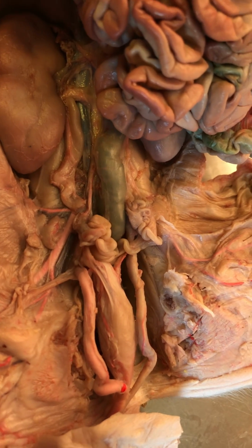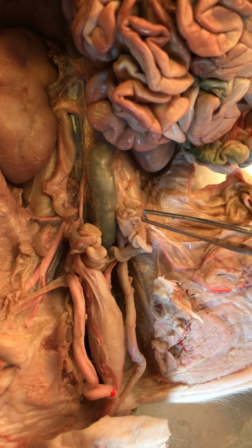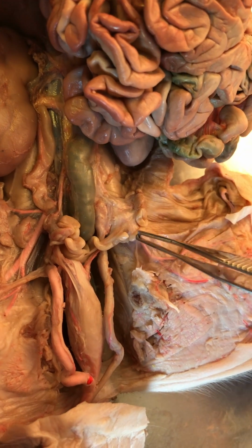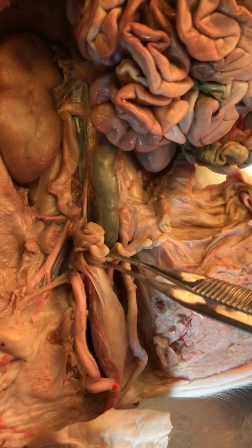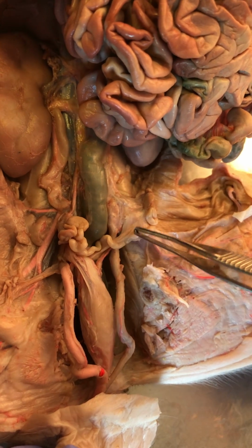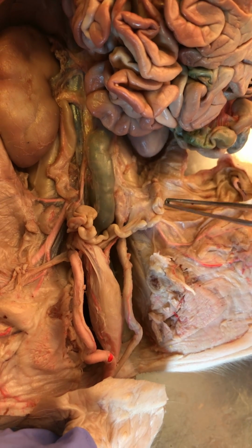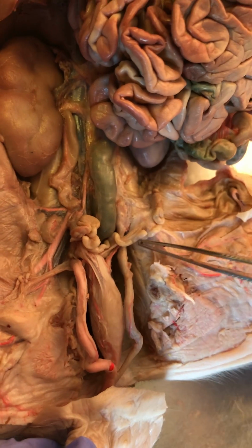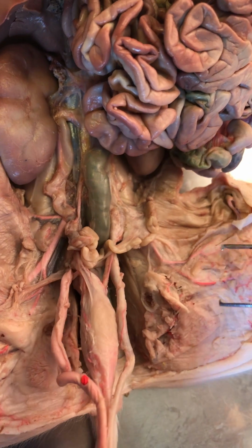There are tiny tubes there, right? You see that? That's actually the oviduct. That's the oviduct. So that means, well, what is this, right? This is the horn of the uterus. So remember, she's a fetus. The other horn of the uterus is here. And if these guys had grown up, they'd weigh a couple hundred pounds, I guess, and they would have a whole litter of fetal pigs. So animals that have litters typically have horned uteri like this. It's unfamiliar to us.